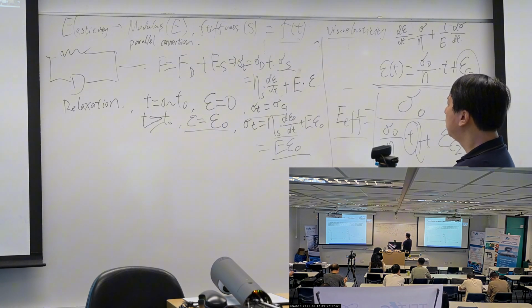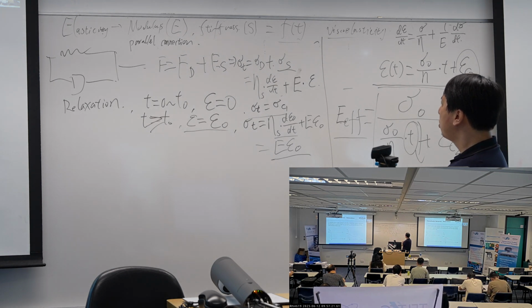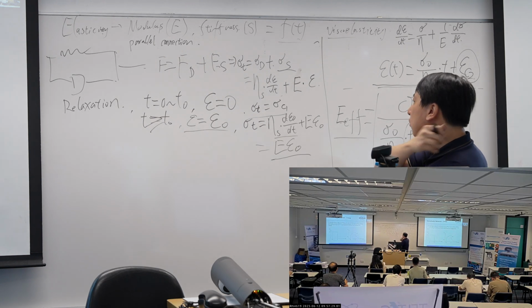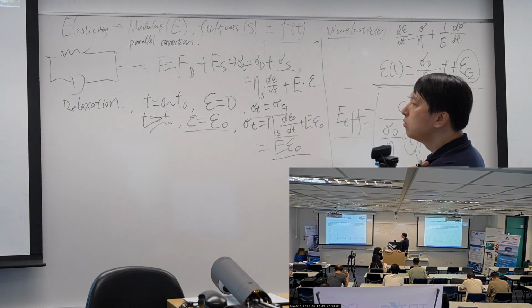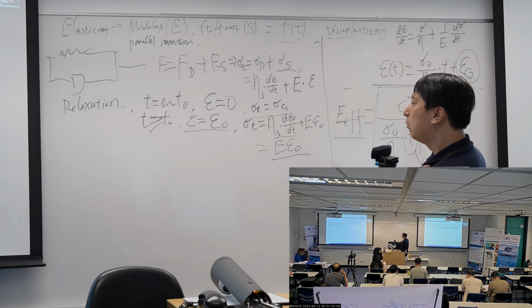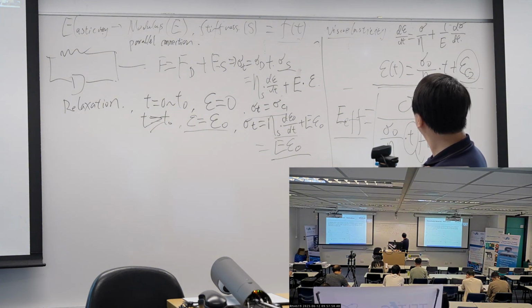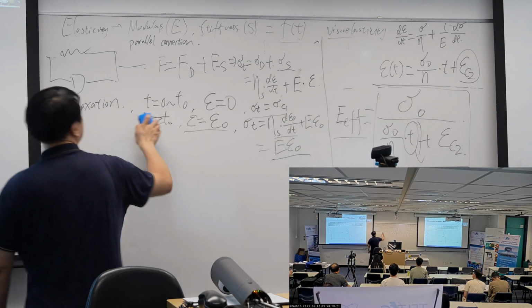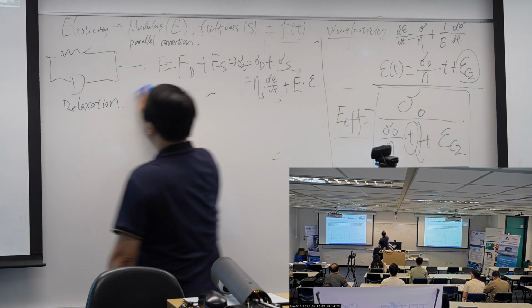Epsilon is a constant. Oh, I'm sorry. I messed up the condition.